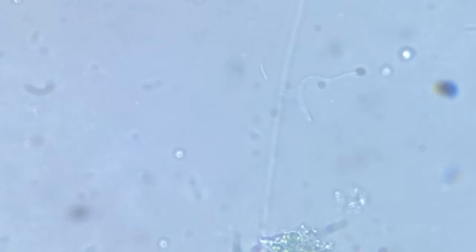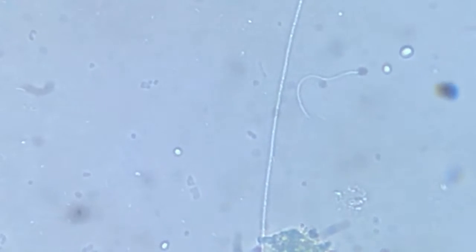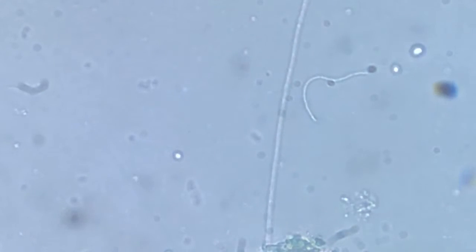Here is one, surely, and we can see it's moving as well.